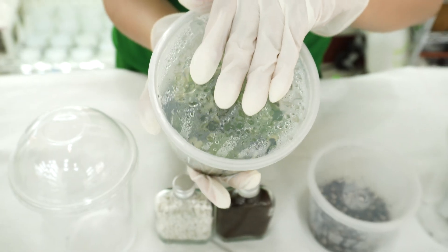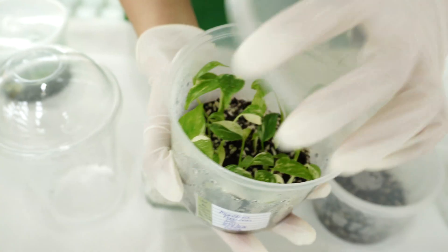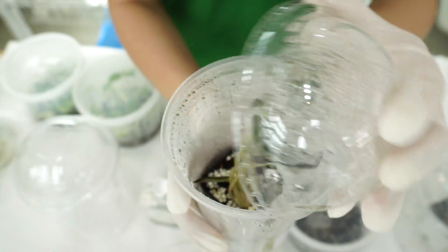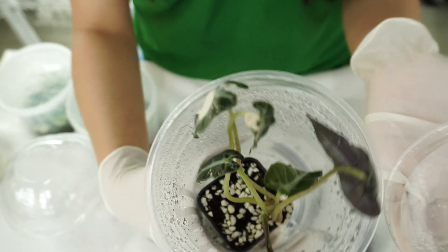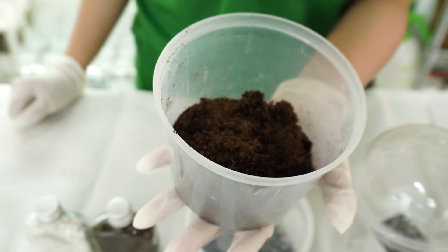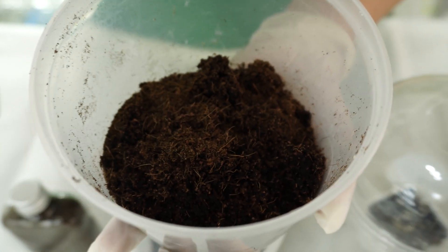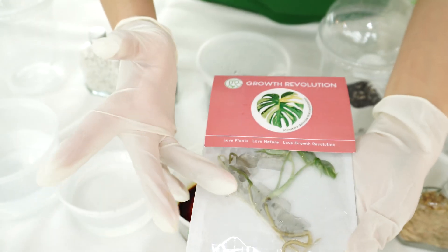This is an example where we acclimatize plants in one larger container with many plants in it, and we also have one plant in one dome plastic cup with a little pot inside. If you don't have peat moss, you can also use coconut coir, but make sure it has been disinfected already. We use the same ratio: 50% perlite and 50% coconut coir.